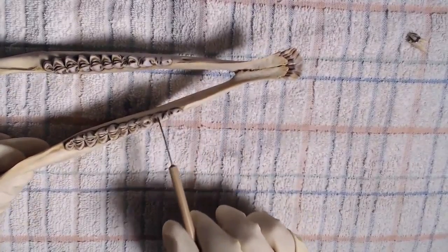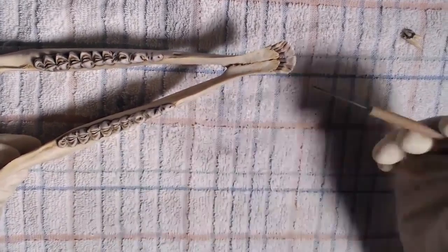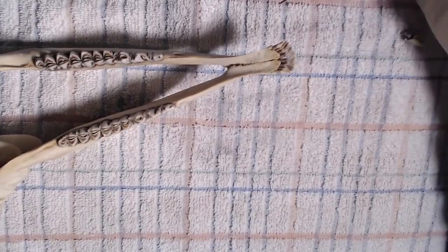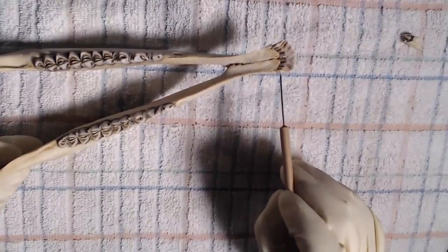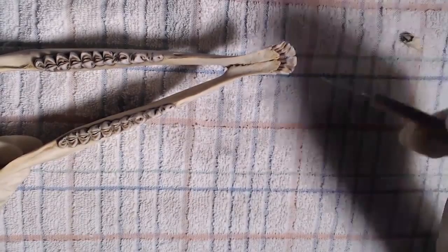We already talked about the premolars and the molars on the cow jaw, which the deer jaw also has, but I also wanted to show you, so we have our incisors in the very front, and then the teeth on the very outside of the incisors on each side, this one here, and then this one on this side. These are the canines.